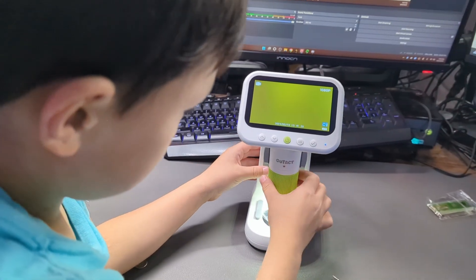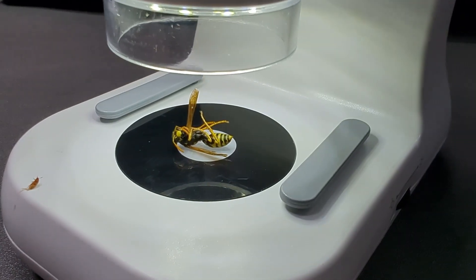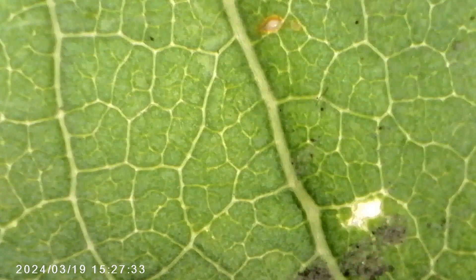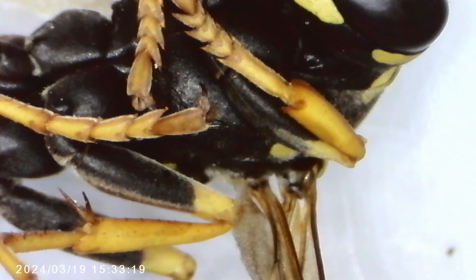You can also download some software to use with this, but honestly this screen is big enough that it works really well. The zoom on the screen is just a digital zoom, so you're not getting any extra image quality — you're just zooming in digitally. What I like most about this is every time I get it out, I tell my kids to go outside and find something cool to look at, and they come back with cool things. My son found a tiny bug, kind of smashed it so it wouldn't move, but it was still alive — you could see the antenna moving. We've looked at fabrics, leaves, a moth that died. You can zoom in on the eyes and see how amazing insect eyes are. The most fun was looking at that wasp and watching it move around and seeing everything up close. Every time I get it out, we just have a blast.